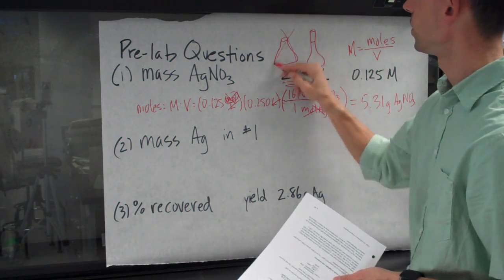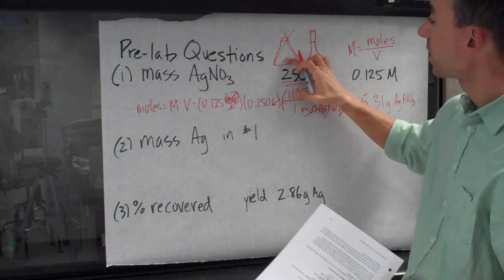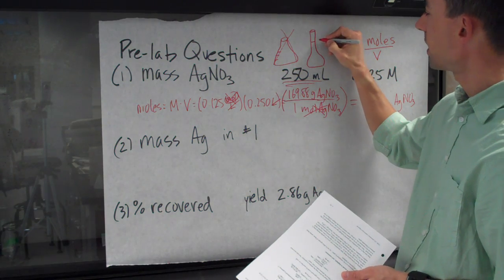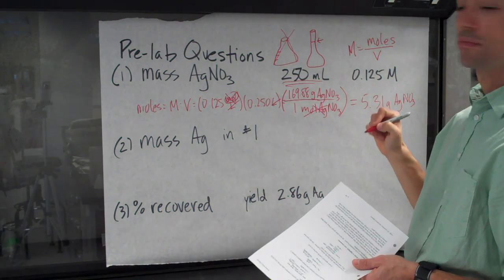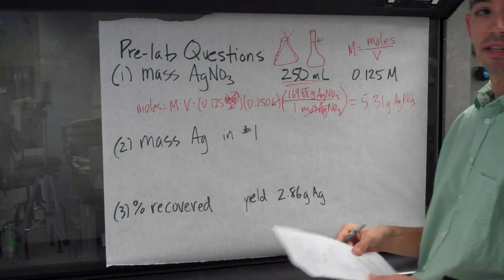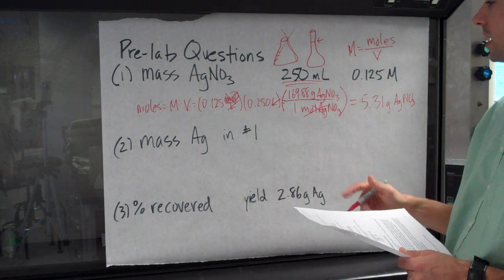All right. So we don't want this because their volume markings are much more inaccurate. This type of glassware has only one volume marking on it, and so you'll choose one well, for the appropriate size that you're indicated in the lab today.